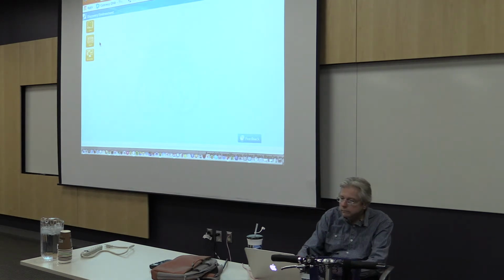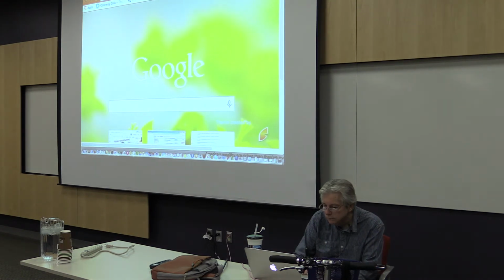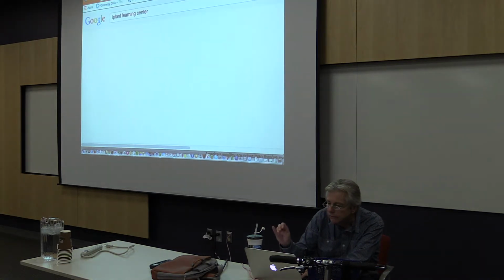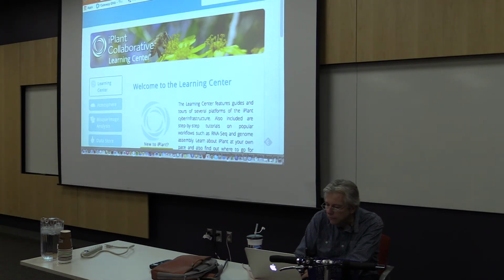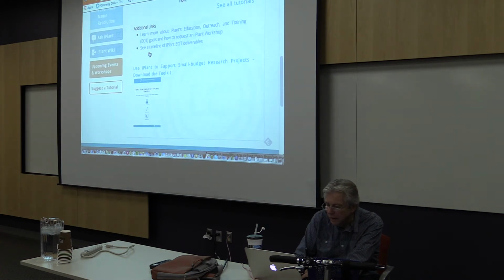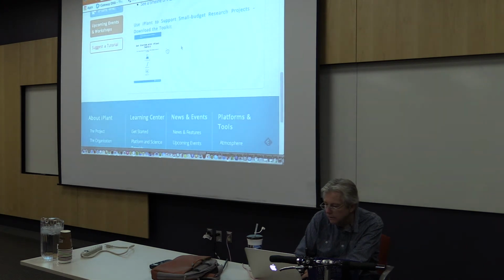And if we use Google, we can use the iPlant Learning Center. And you'll see all this really nifty stuff in here.